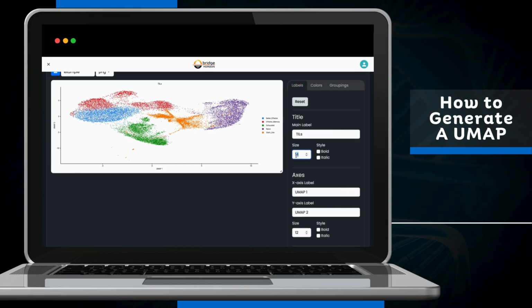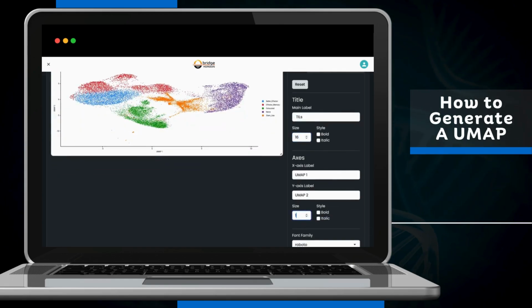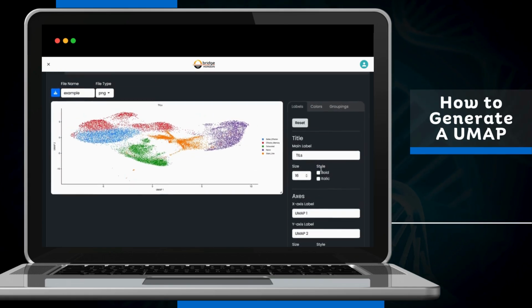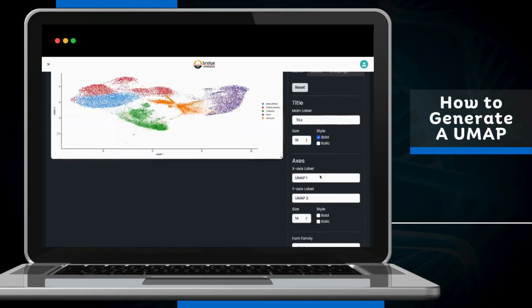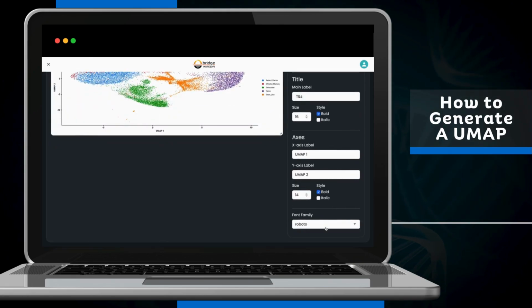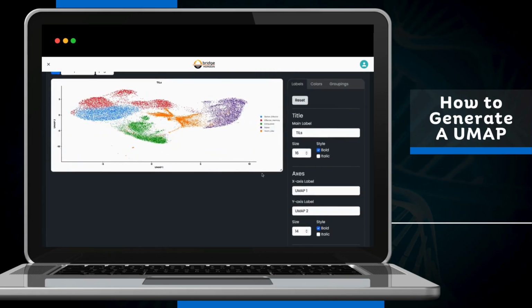So I'm going to go from 14 to 16 for my main title and 12 to 14 for my X and Y axis labels. In addition to that, you can change the styling for your main title as well as your X and Y axis labels, as well as change the font family for your X and Y axis labels as well as your main title.